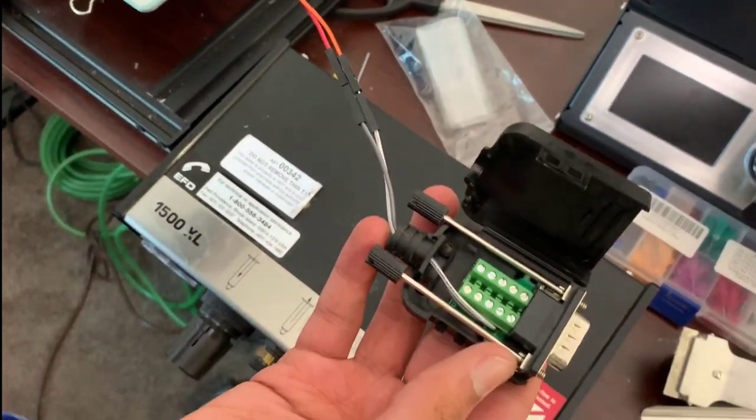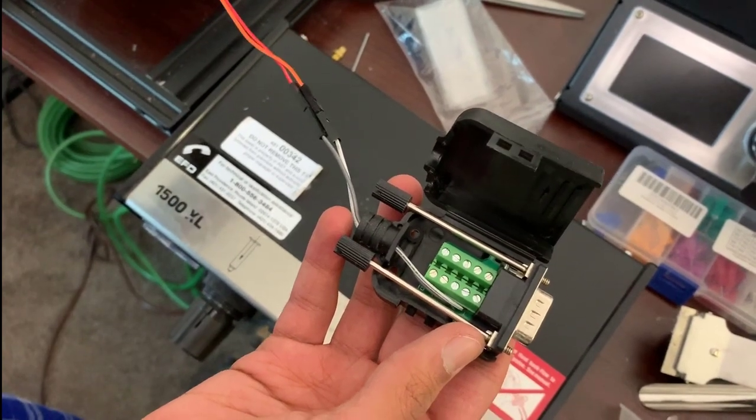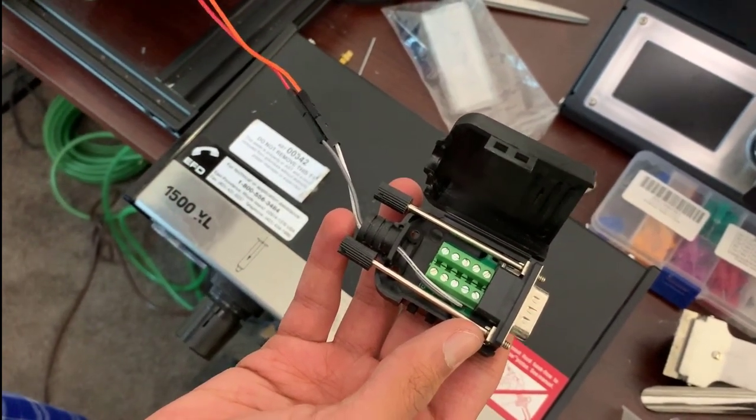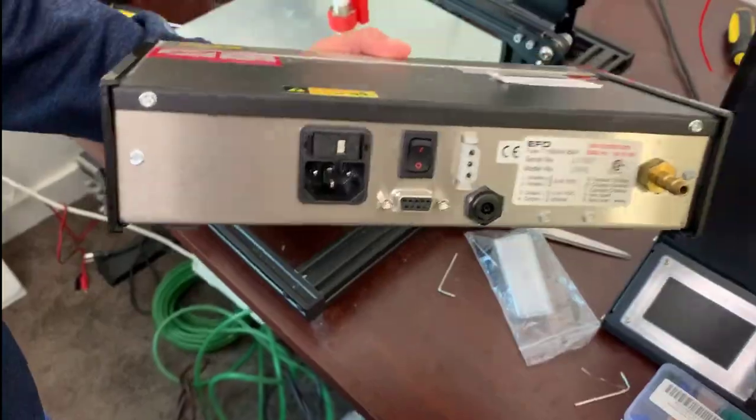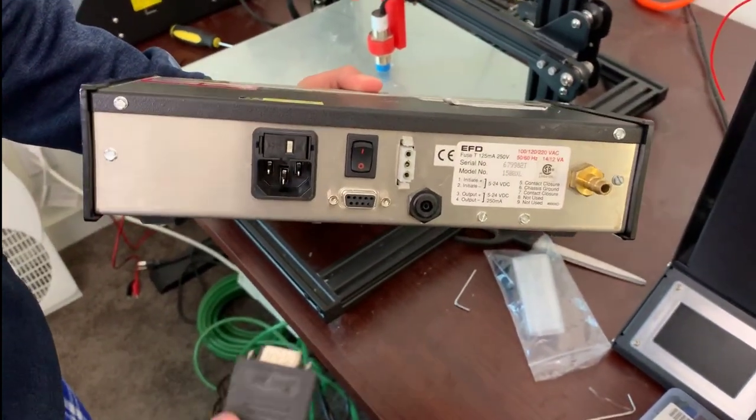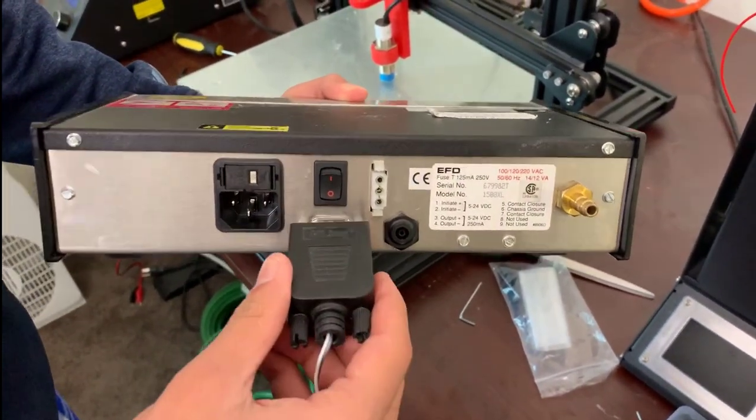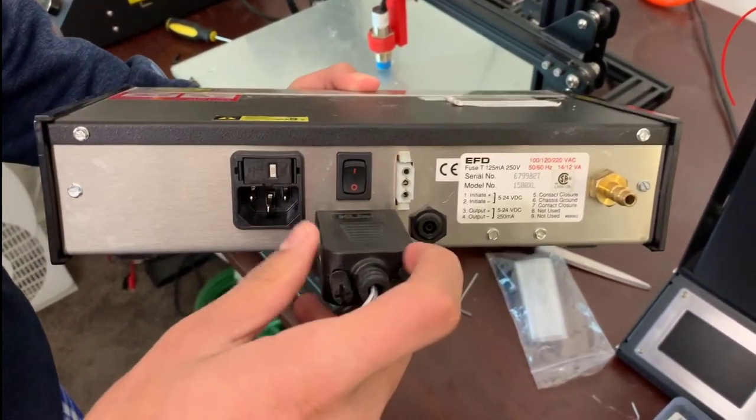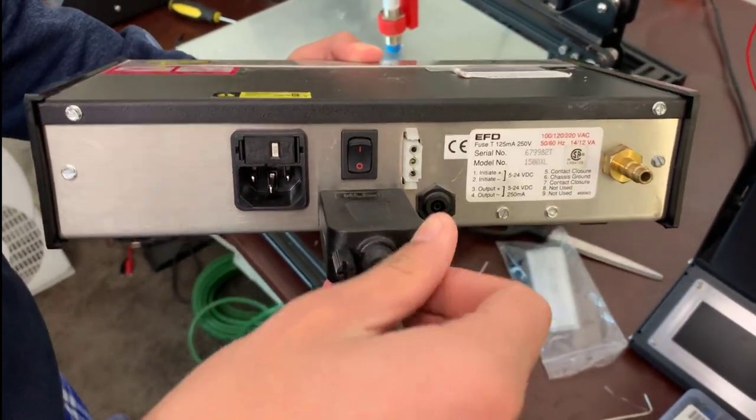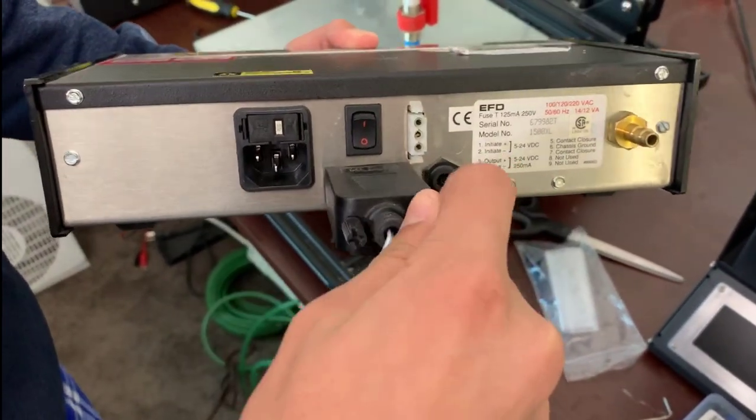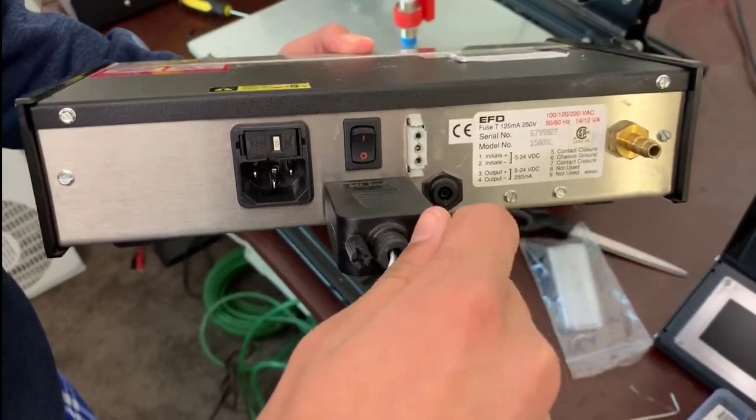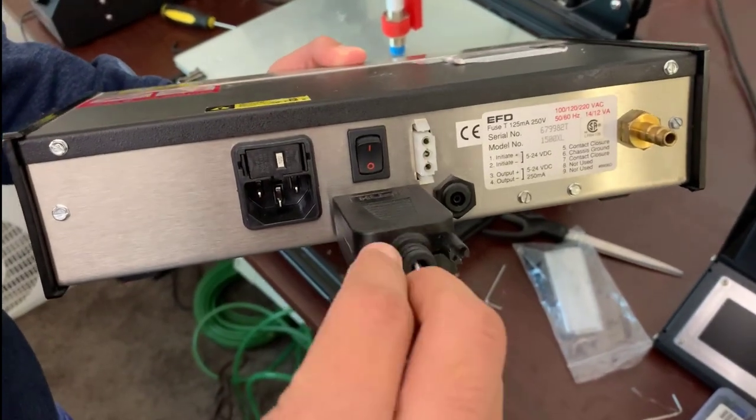As you can see, the leads here are connected now to the pin out port. So now that we've attached the actual leads to the serial port connector, we're going to attach the serial port connector to the serial port on the EFD dispenser.